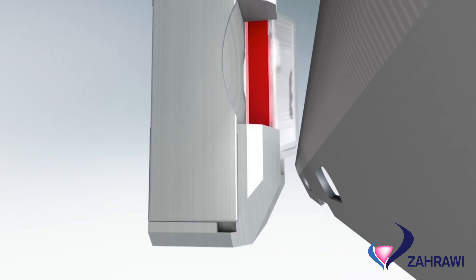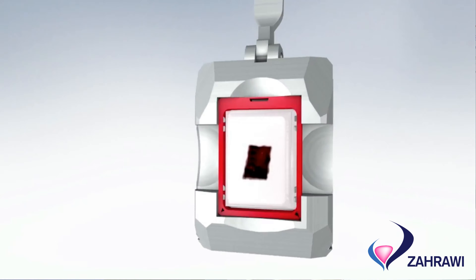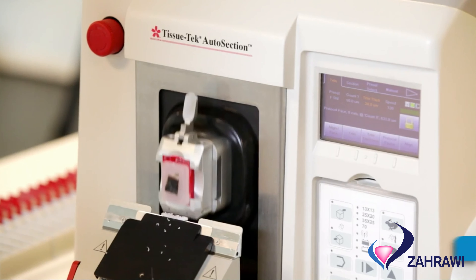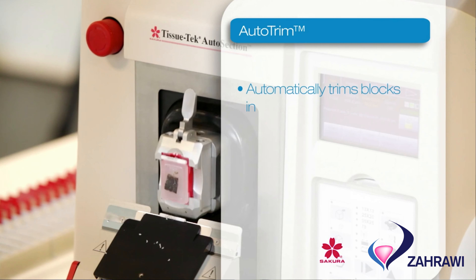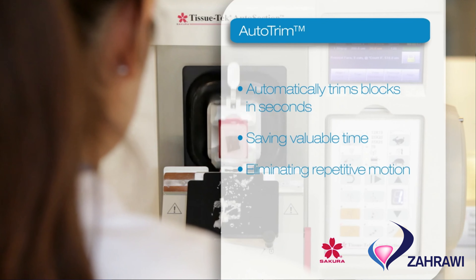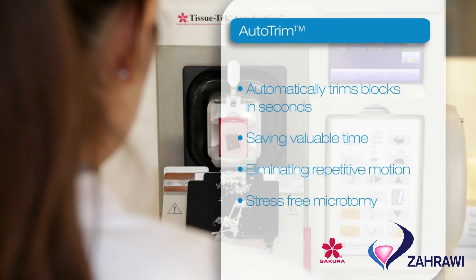The next element is about auto-trim and auto-section. The auto-trim will allow us to remove the wax in front of the block to give a full face of tissue. This auto-alignment and auto-trim occurs at just the touch of a single button, and that's what makes it unique compared to all the other systems out on the market.